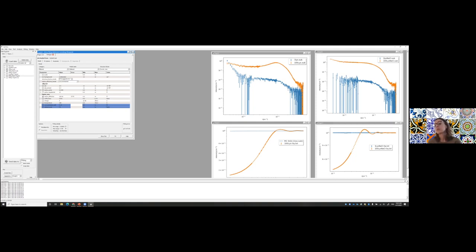You just want to look at interactions. And NMR is not telling you that, and cryo-EM is not telling you that. You want to know what types of interactions are going on because you want to stabilize a formulation, for example. Then you'd want to use SasView. So you could still use that starting structure, but then you'd want to fit your structure factors and try to find out, is this an attractive interaction? Is it a repulsive interaction? Do I need to add more salt? Is it a question of varying the pH? How high in concentration can I go before these interactions contribute too much?